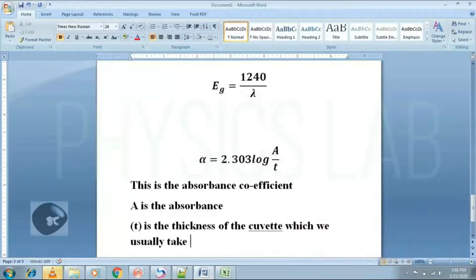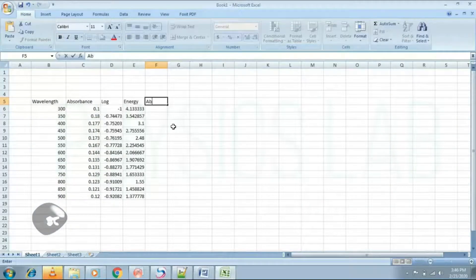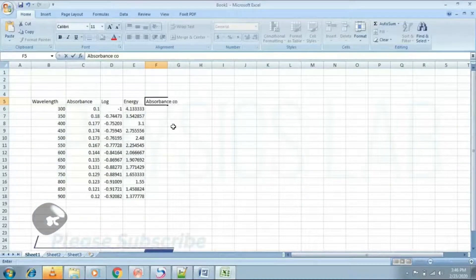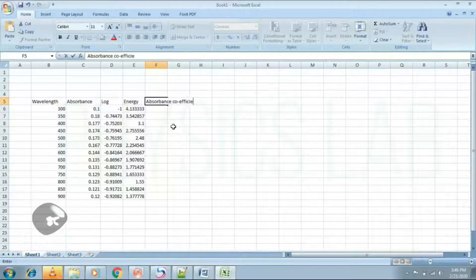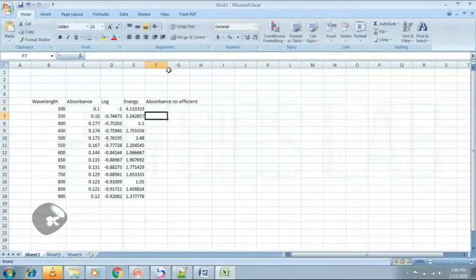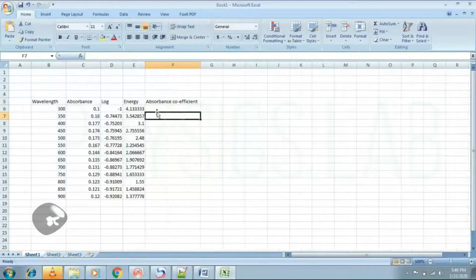Step 2: Find the absorption coefficient.